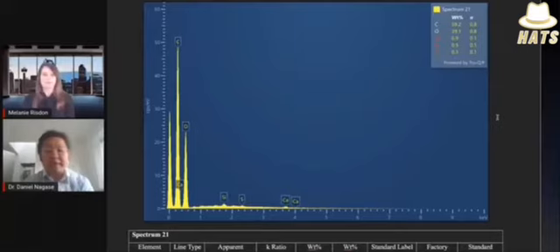Okay. And then again, the other part, spectrum 21 of that structure, is carbon, oxygen, calcium, and silicon, with a little bit of calcium. So again, there's no signs of biologic elements, nitrogen or phosphorus, in any of what we saw that looked like mold spore sprouting legs. So this was also seen in the Moderna sample, the same batch of Moderna that we were looking at before that had these chips and crystals in it. So then let's move on to the third Moderna file.